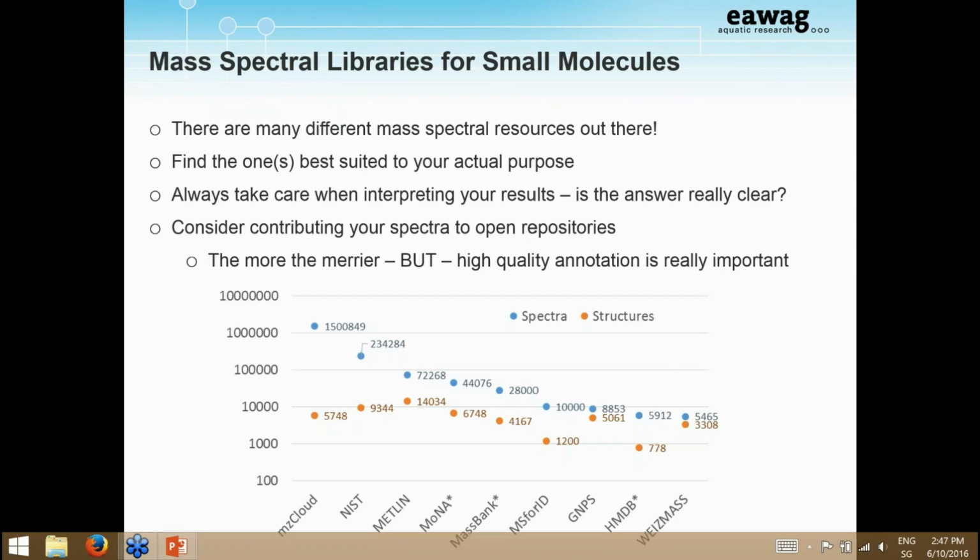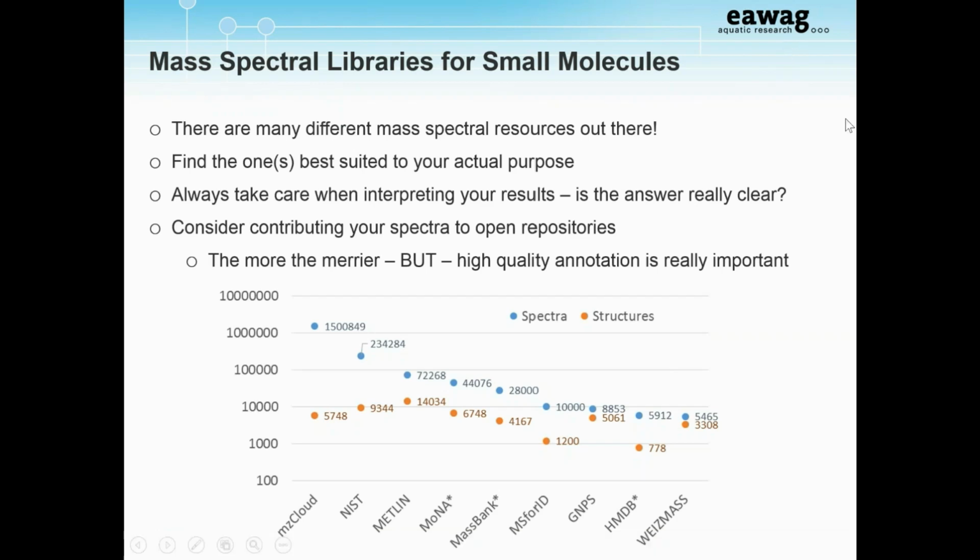So, coming back to the question session, we have quite a couple of questions. Let's start with some GCMS related ones. For example, in a typical GCMS run, say plasma samples, what percentage of compounds is expected to be derivatized and what remains underivatized?